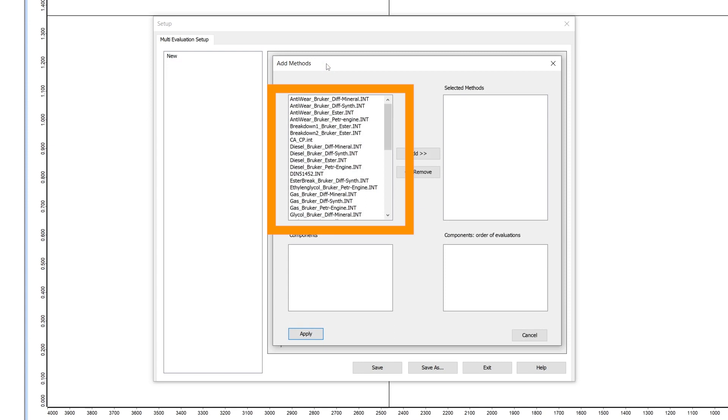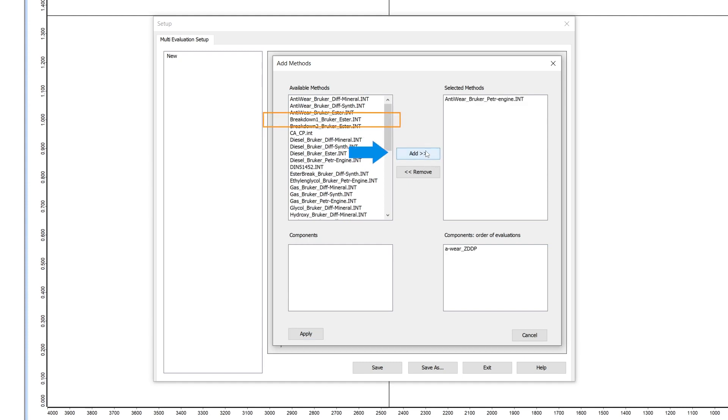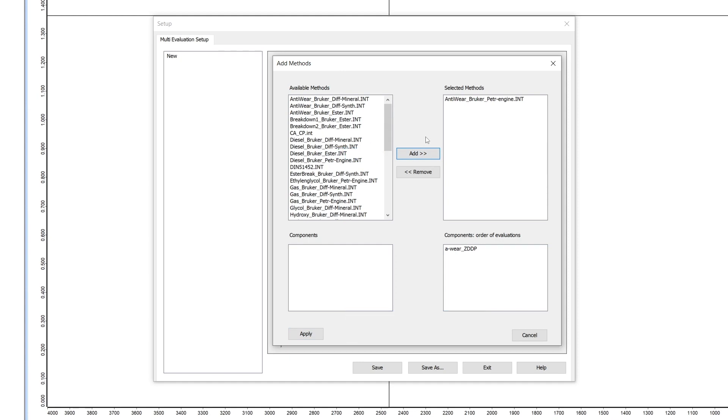In the left area we see all integration methods from the quant folder. Select one via left click and press add, or work with the shift or control buttons to add more than one at the same time. Remove it via the remove button.